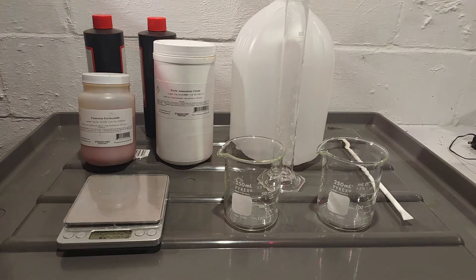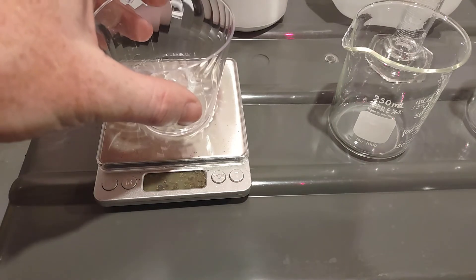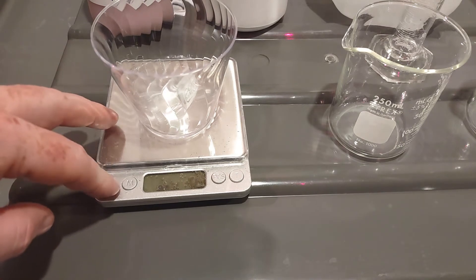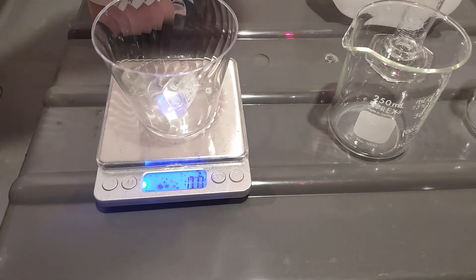First I'm going to weigh out the ammonium citrate powder. It's very light so there's going to be a big heaping amount. I recommend getting these little cheap plastic disposable cups to hold your chemistry when you weigh it. I'm going to turn the scale on so it zeros out. I'm going to make 200 milliliters of solution so I need 50 grams of the citrate.